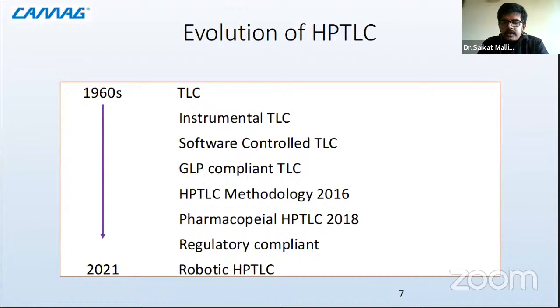So you must have heard about TLC, thin layer chromatography, and how it has typically been practiced in the age-old technique. You had a paper, and on that paper you spotted either a pen spot, which is a form of ink, or a paste of chlorophyll, and then dipped it into a solvent, that is your mobile phase, and allowed it to separate over that stationary phase, which is your paper, and all the components get separated out to understand what the composition is made of.